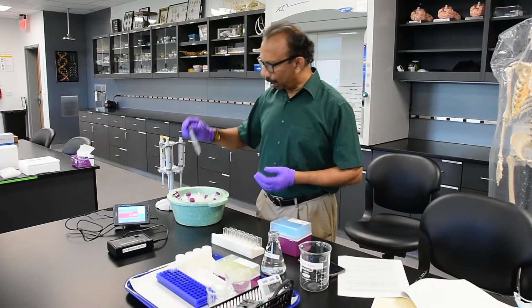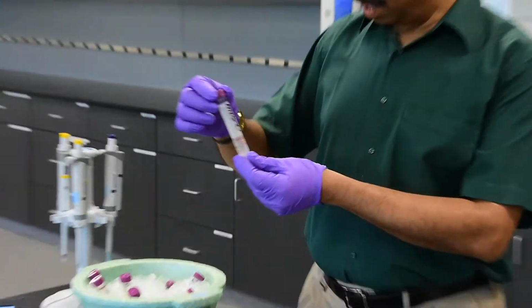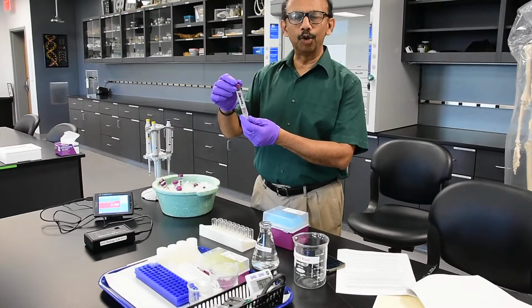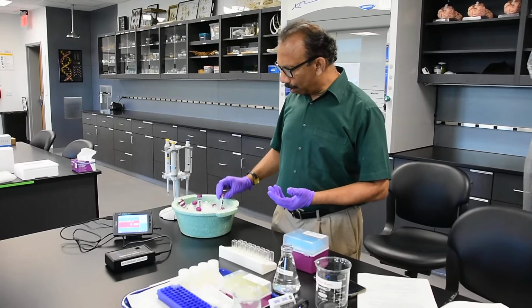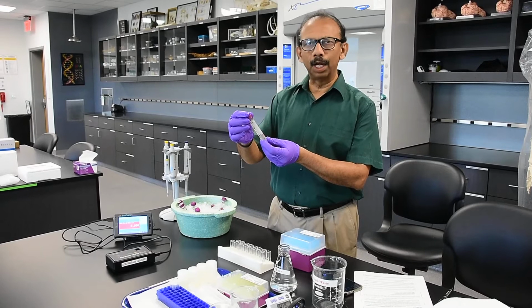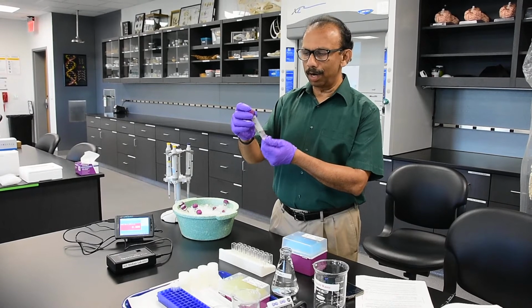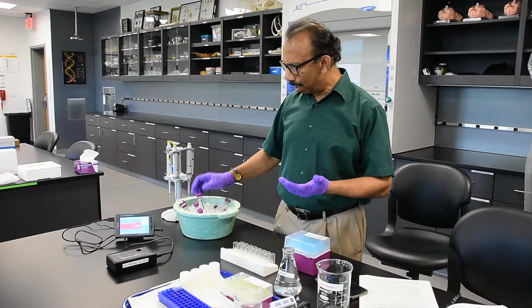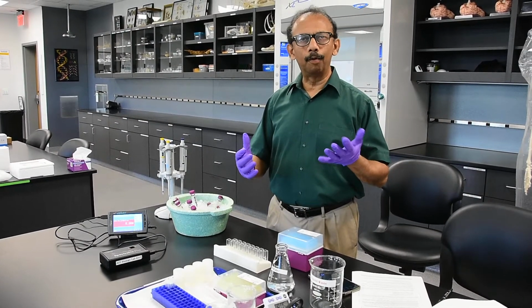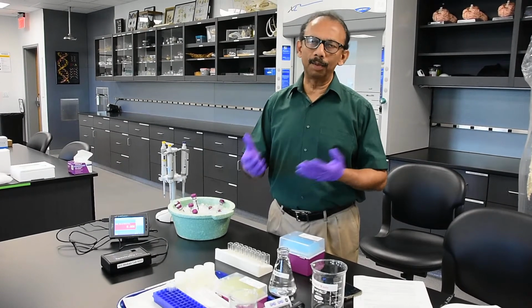So the enzymes are kept in a diluted form, and this is a glucose oxidase enzyme, and the substrate is glucose, that is the sugar that we consume. It's a 6-carbon sugar. The enzyme glucose oxidase breaks this down in the presence of oxygen, and then it releases hydrogen peroxide, and we are trying to measure the activity of this hydrogen peroxide after glucose oxidase works, using the compounds called phenol and 4-amino antipyrine. So that produces a color. The more color there is, the more enzyme activity.